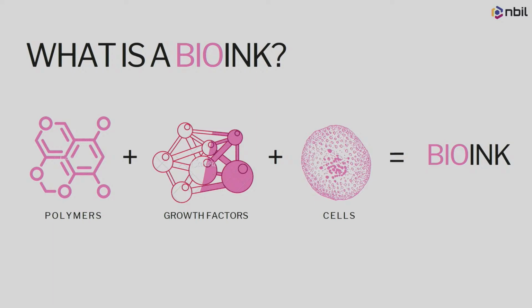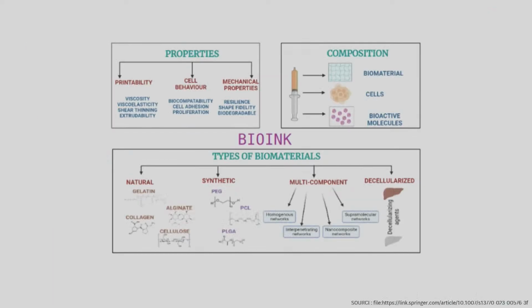So to minimize that stress on the cells, you have to ensure what kind of gauge you're using, what kind of pressure you're using. But also out here, the material plays a very important role. The material should be giving a habitable environment for the cells to survive, proliferate, and grow inside happily, right? So that's where the choice of polymer that you are going to use for developing your bioink is very crucial here. Now, once your bioink is developed, you can start definitely printing.